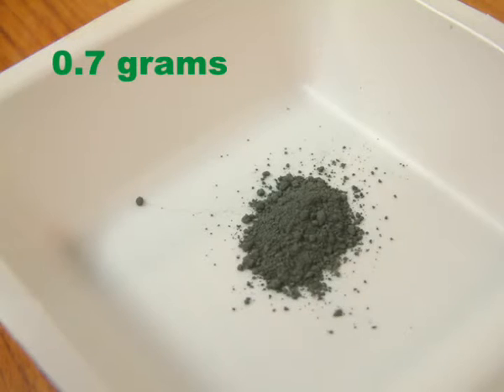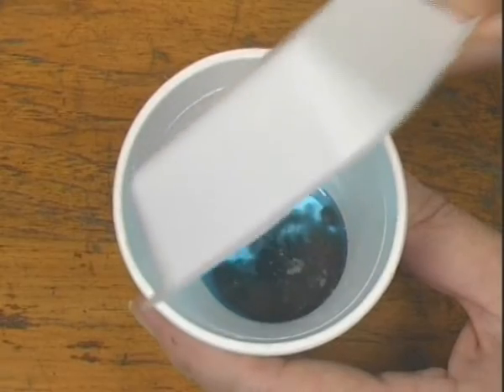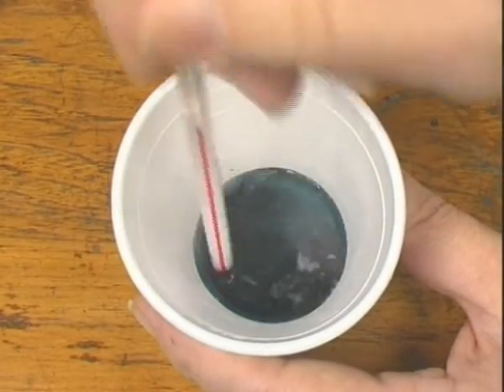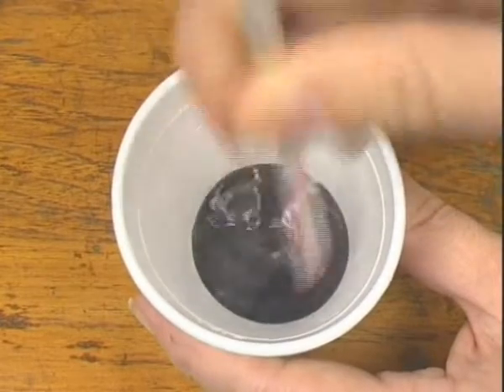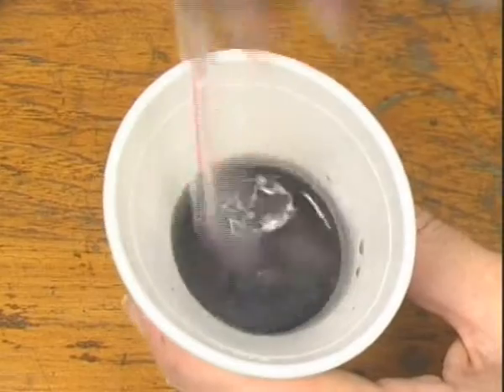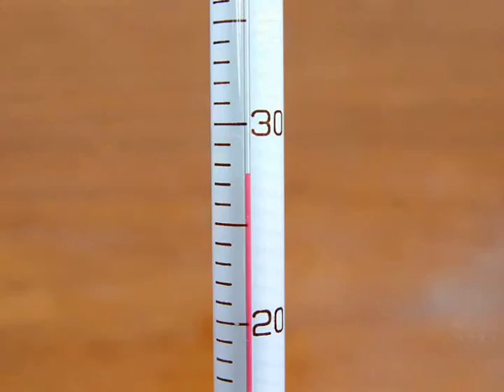An excess of around 0.7 grams of zinc metal powder was added and the mixture was stirred well. Make a note of the highest final temperature.